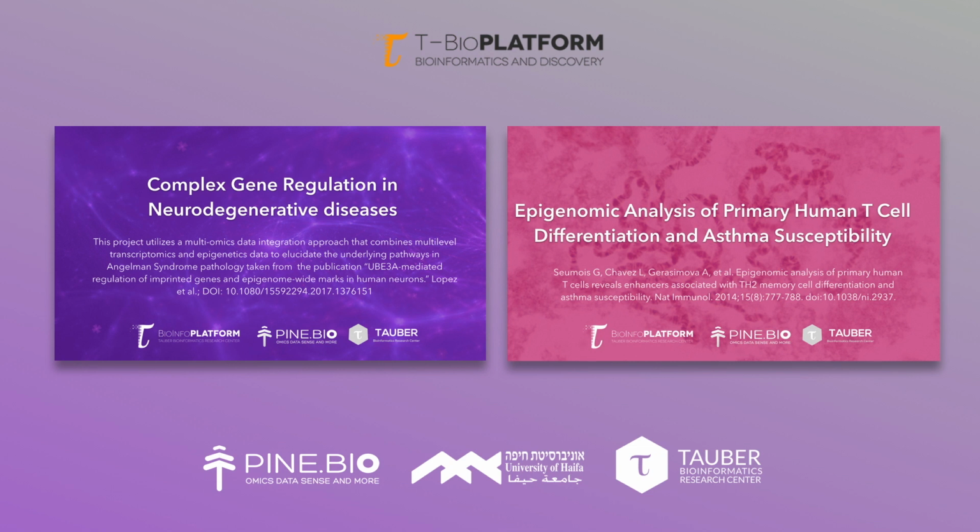If you want to take things further, we recommend diving deeper into the Angelman project or this other project focused on asthma. To help you get started with these datasets, we prepared guides on accessing all of the data that include ChIP-seq, bisulfite-seq, and RNA-seq datasets. In the project, you will find data, guides, and explanations of methods you can rely on for analyzing and integrating this multi-omics data.